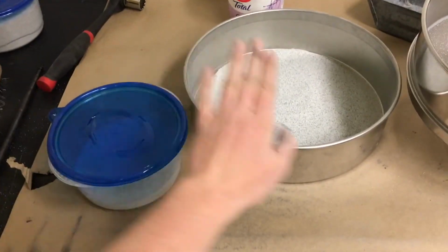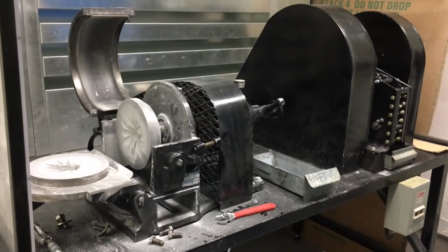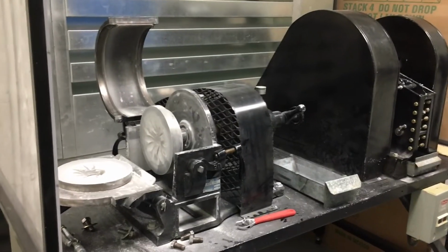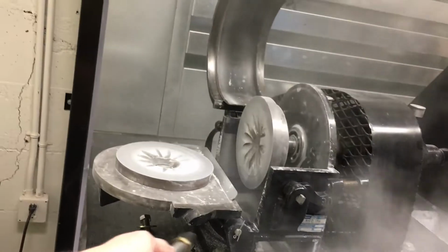Next step, cleaning. Now that my sample is crushed and sieved, I begin cleaning this room for general cleanliness and to eliminate contamination of samples for the next person. This takes about 30 minutes. Here we go!